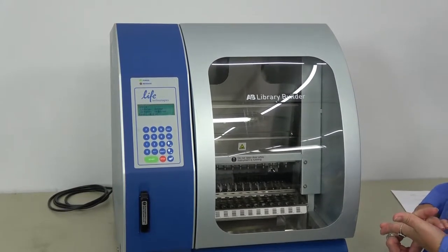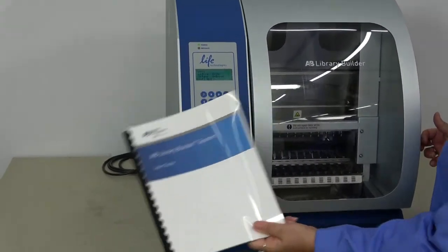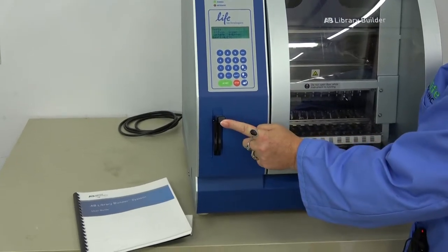It also supports whole genome resequencing. We do have the user guide available for this instrument and we were lucky enough to also have one of the library cards to go with it.